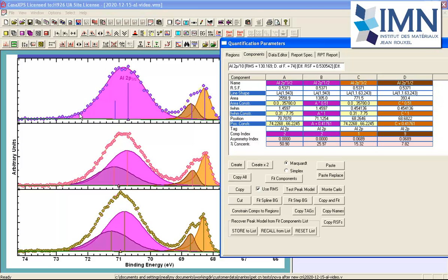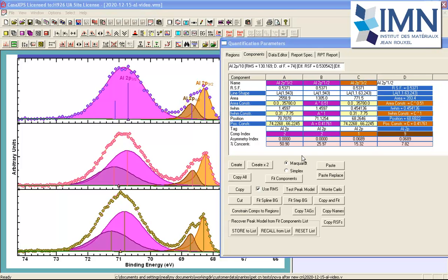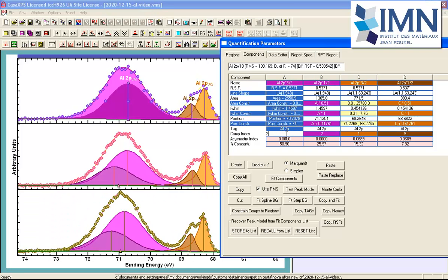So we can see here we have a peak that is drawn as a single component, but it actually consists of two components where the centres are marked here with these individual markers. In this example there are only 4 components, but in other peak models there may be multiple components representing sets of doublet peaks. So there are options in terms of keywords that allow us to adjust the component indices en masse.